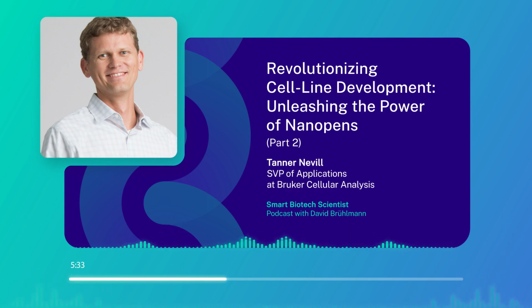And if you can understand that really well, and I know the big players are really good at this, they are so data driven and they know exactly how much a day costs when it comes to going from DNA to IND. They know how long that takes and how much every day costs. Small players and folks trying to get into this should understand that very well. And then when it comes time to making decisions about, should I do limiting dilution or should I buy a Beacon or buy some other technology, you'll be informed to make those decisions.